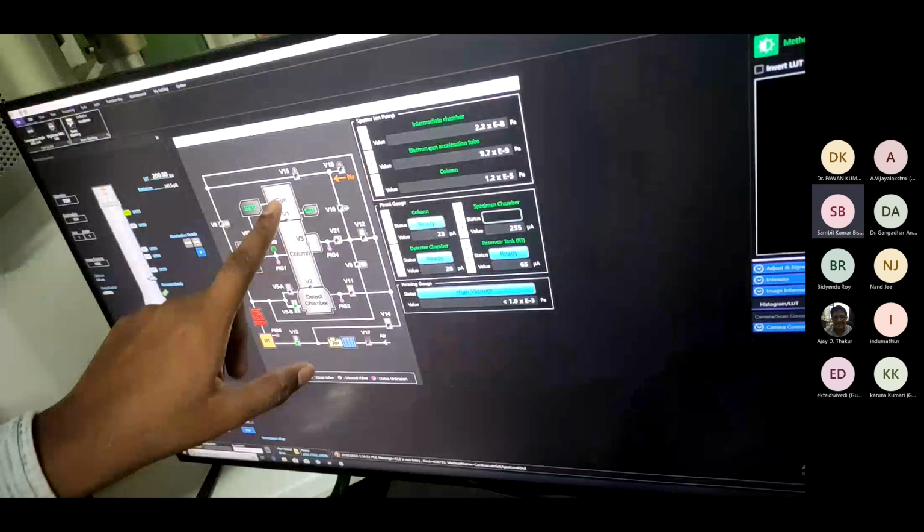So there is a locking screw. I'll keep inserting inside. Okay. So I have to hold it. So what will happen after inserting the holder inside the specimen chamber? Right now it is not in the column. Okay. So we'll wait because right now nitrogen gas is purging inside the specimen chamber.